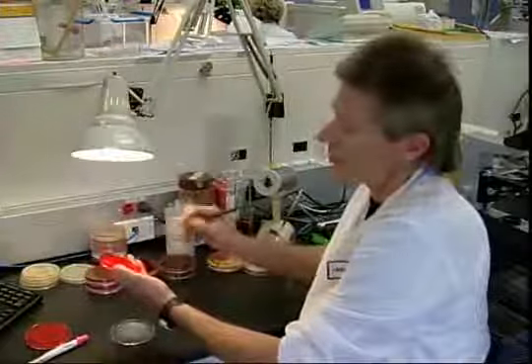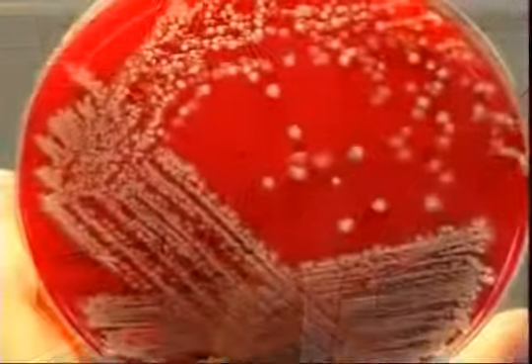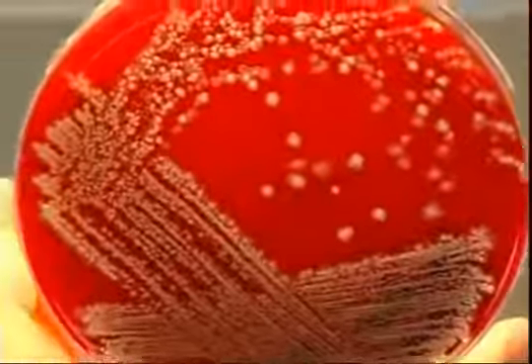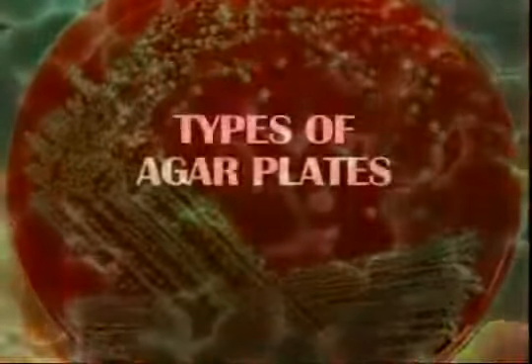If I had a bag of, say, white marbles, but I was looking for one specific black one, the way to find it would be to take that bag, open it up, and spread those marbles out. Well, that's basically what we do when we streak the plate. We're spreading out the inoculum to find the specific pathogens that might be there. And as you can see, the material has been spread out. And what we have here is individual colonies. And now we can work with each individual colony and do testing on it.